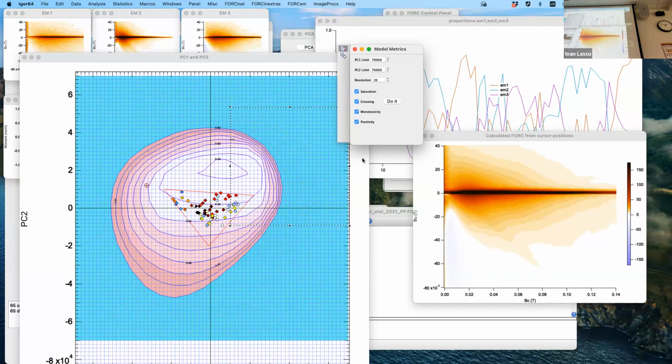Right, so I basically set the end members and then I ran that. And the question was, should we run these first and then set the end members? I'm not sure what's going to happen if you run these first before actually calculating the proportion. So it may be just a way the software works, that you have to first run the first calculation of the end members and then do the rest, but maybe Rich can chime in.